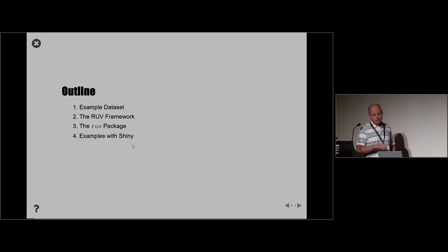So the way this talk is going to go for the first session, I'm going to introduce a data set. It's going to be a gene expression data set. And I should say right now, pretty much all the examples we talk about today are going to be with gene expression data. But the methods should apply, and do apply, to several other types of data, but to keep things concrete, we're going to focus just on gene expression data.